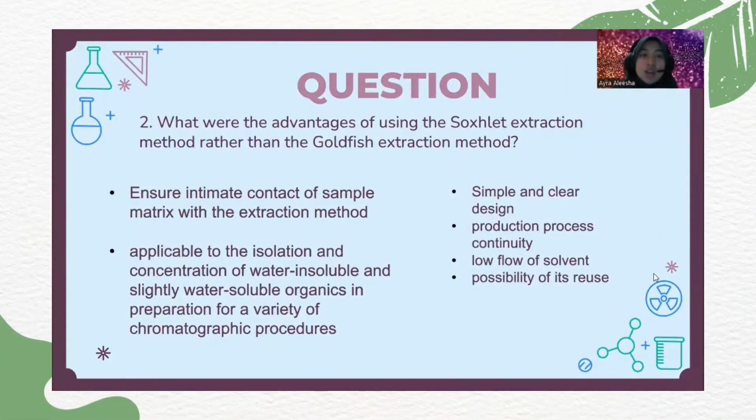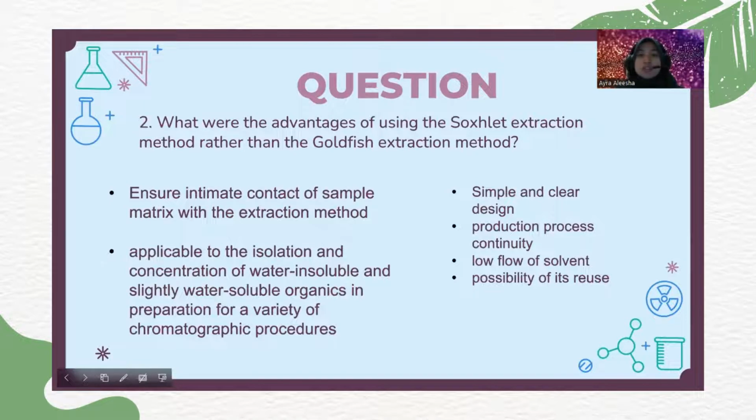Second question is, what were the advantages of using the Soxhlet extraction method rather than the Goldfish extraction method? Firstly, it ensures intimate contact of the sample matrix with the extraction solvent. Secondly, it is applicable to the isolation and concentration of water insoluble and slightly water soluble organics in preparation for a variety of chromatographic procedures.